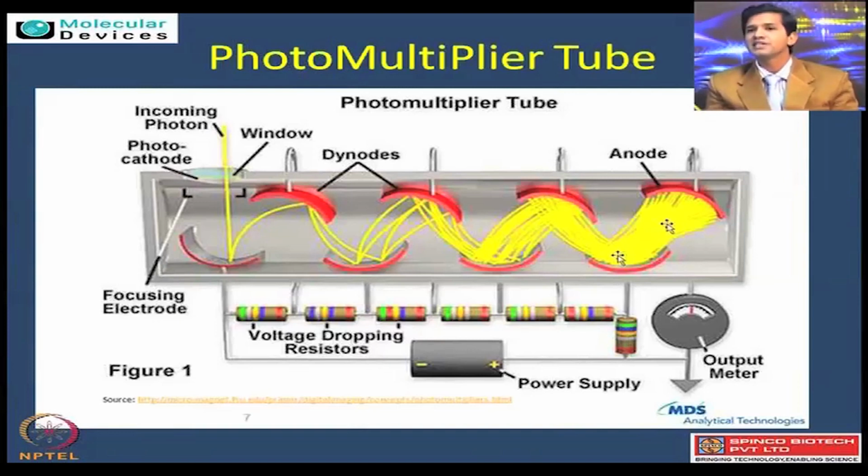The white spot essentially means saturation, and except for a few controls, people avoid that happening. Okay. So the best way is to look at the photomultiplier tube condition. It ranges from something like 300 to 700, which helps one control how much photon multiplication can be done, so the lowest can also be seen and the highest doesn't become saturated.